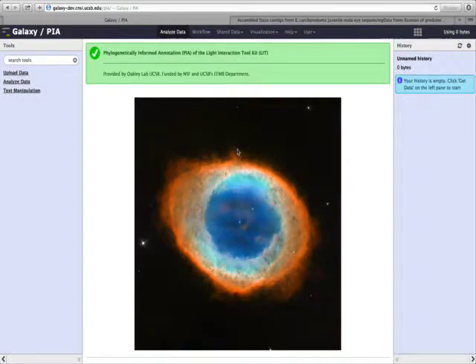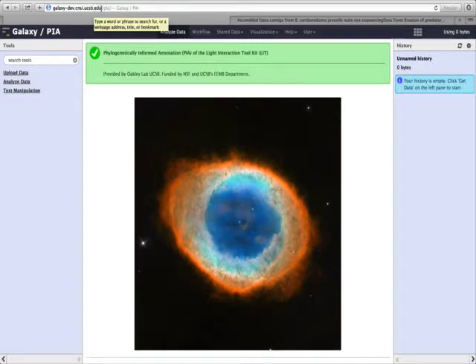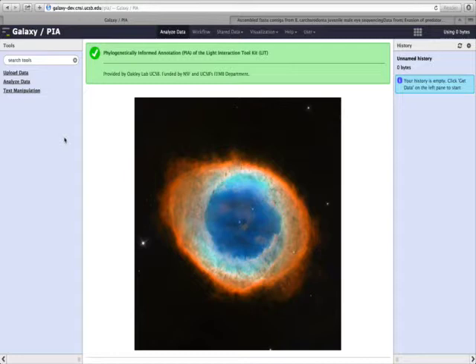To get started using PIA, you'll first need to go to the public website at galaxy-dev.cnsi.ucsb.edu/PIA. If you're visiting the website for the first time, you'll have to register as a user.